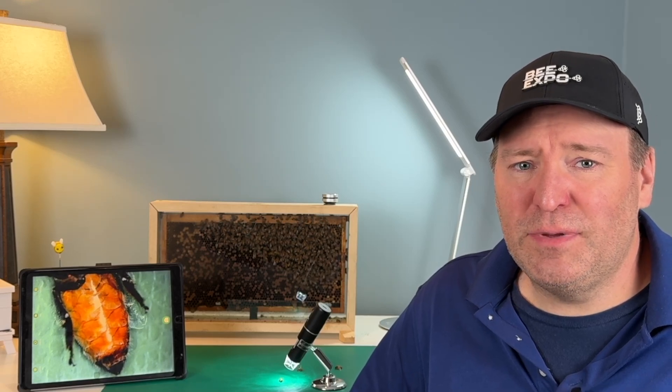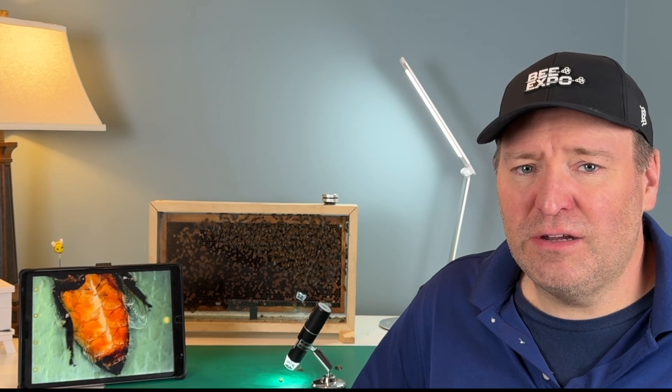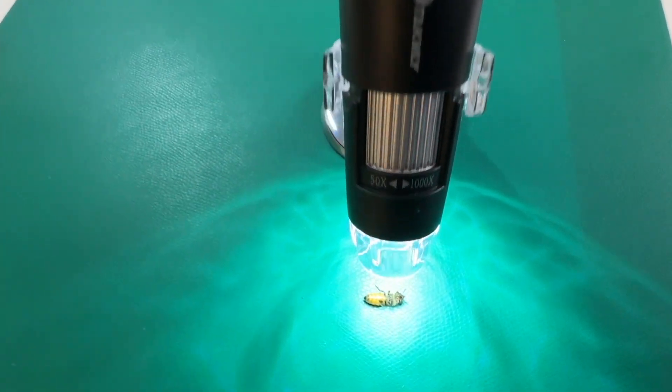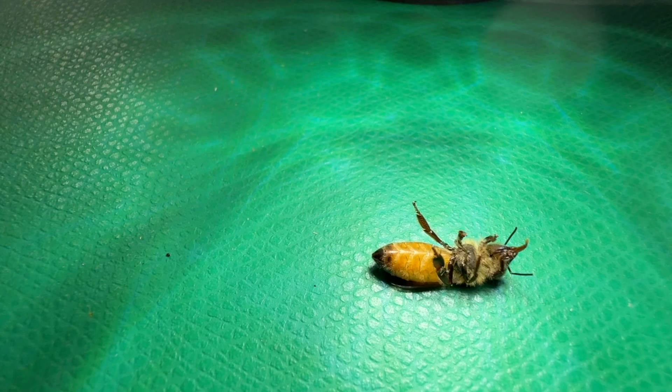I have some sad news. Many of the bees in my backyard apiary have either passed away or are paralyzed, like this bee here that you can see under the microscope. I'm going to show you how I use this wireless microscope to discover what happened and try to solve for this problem in the future.